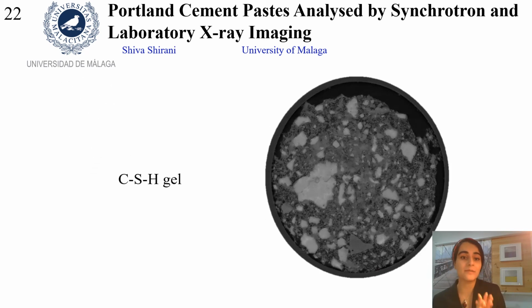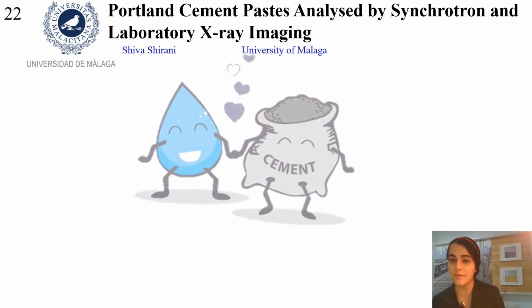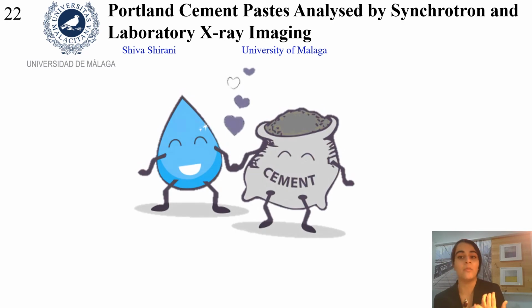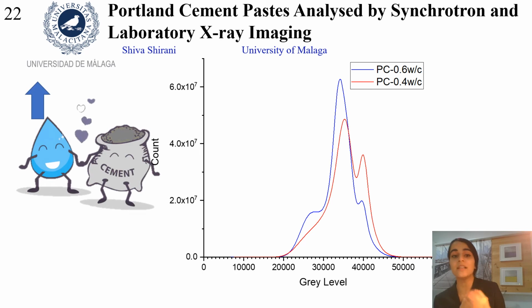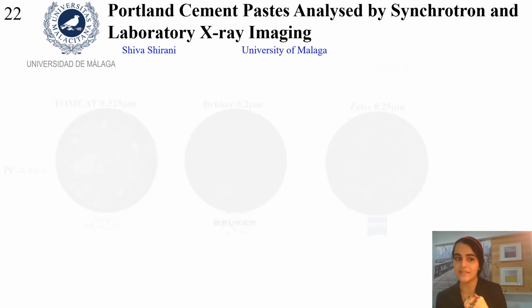And all of this is because of the water to cement ratio, where here we analyze the porosity in the PC paste using laboratory and synchrotron X-ray microtomography after 28 days of hydration. Therefore, with increasing water amount, we expect more pores, more hydrated materials, and less unreacted cements.